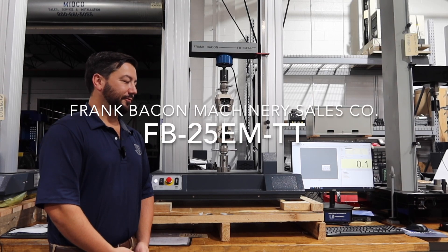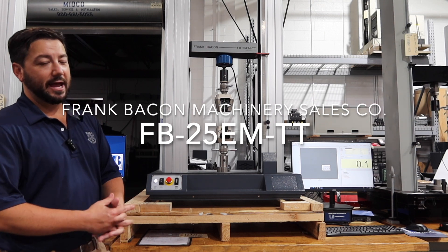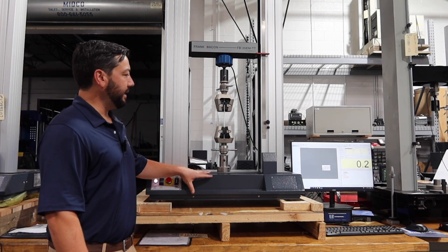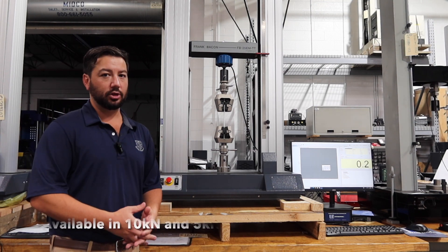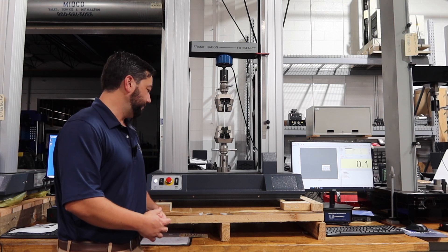Hi, this is Jeff Stenzel over at Frank Bacon Machinery. Today I've got the new Frank Bacon FB25EMTT. This comes in the same frame size but in a 10 kilonewton and 5 kilonewton variant, matched to your application in the size that you need.